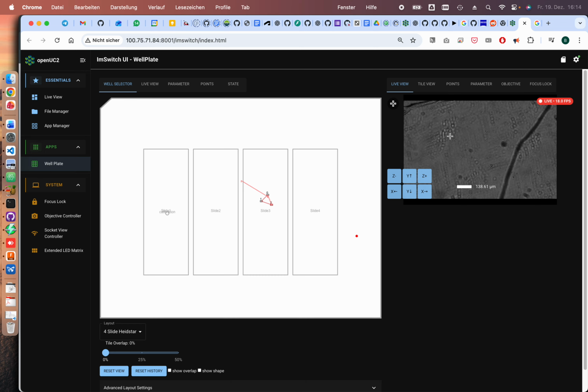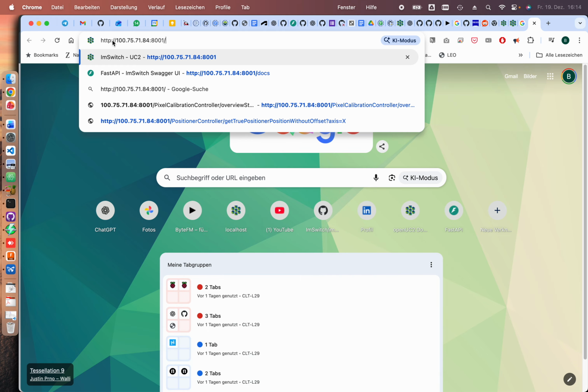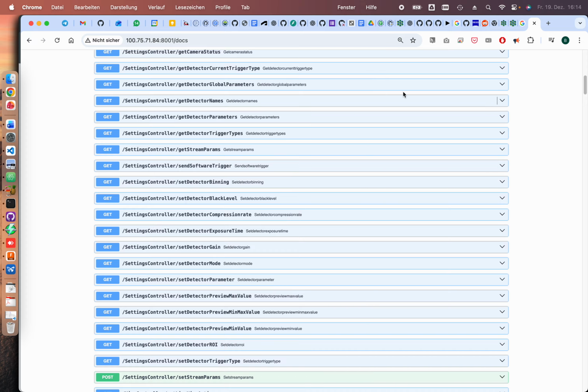And if this is exactly the application you're looking for, this can all be customized also with a handcrafted UI, basically the API. And if you want to use that in your system with your robot, that's all possible.